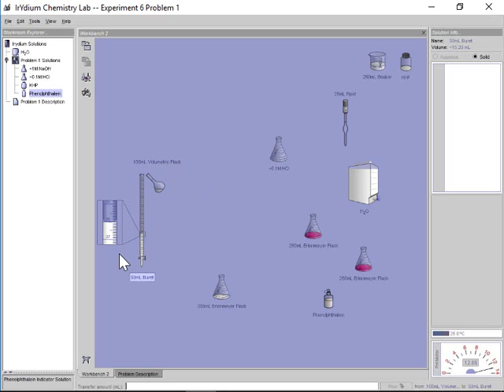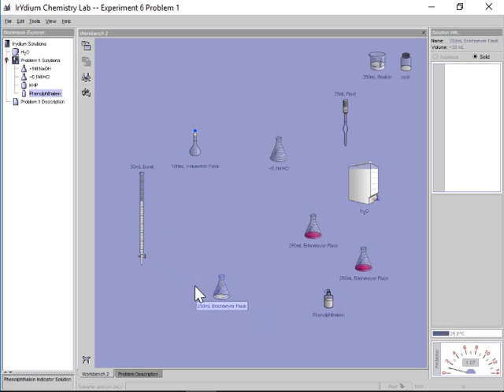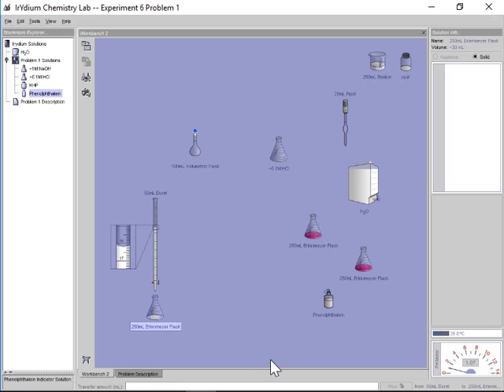So let me just toss in here another maybe 40 mils if I have it. Oh, I don't even have 40 mils. I might totally run out in this case here. We're totally playing a gamble here. 16 into my Erlenmeyer flask here. I'm going to drag that in. Make sure you tabulate that first number. So this was 16.22 or so, bottom of the meniscus here, plus or minus 0.05.